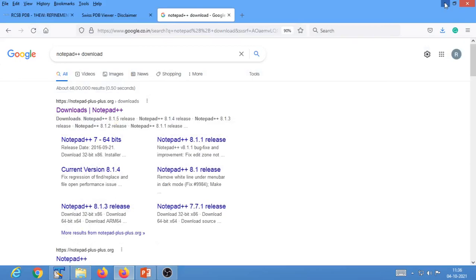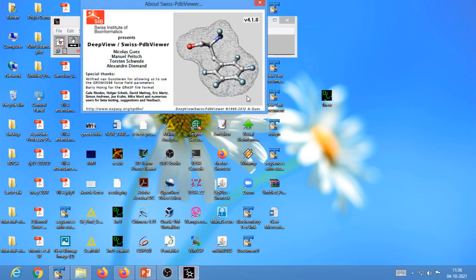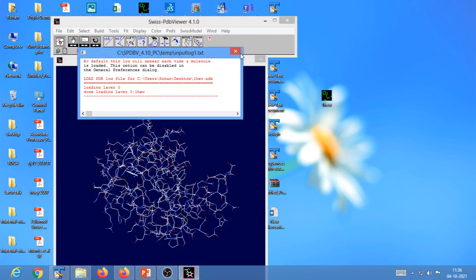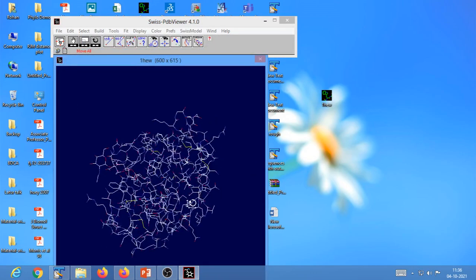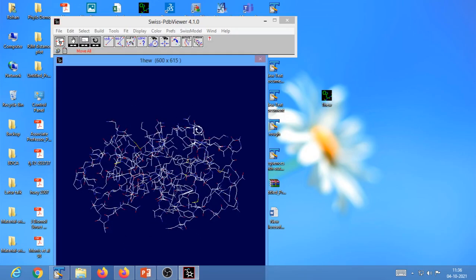One way to see what is provided in your PDB file is to directly visualize it in any protein structure visualizer. For example, in this case we are visualizing your protein molecule in SPDBV.